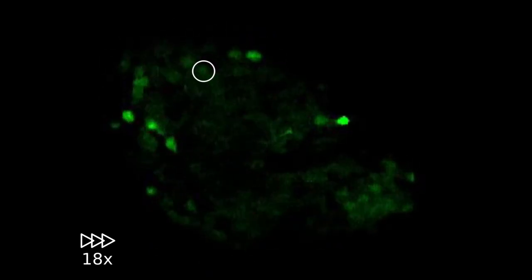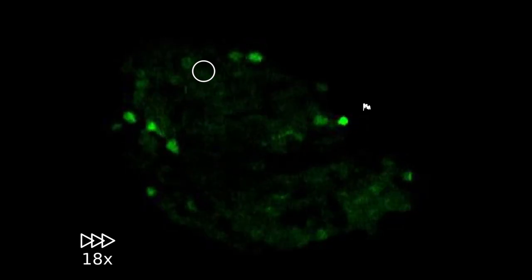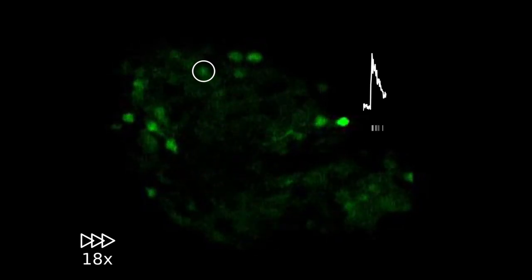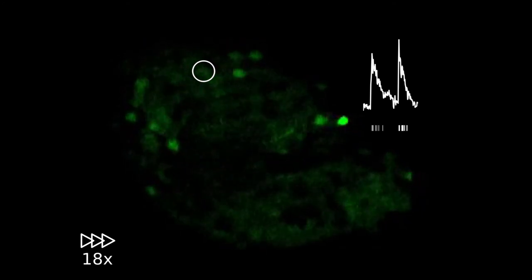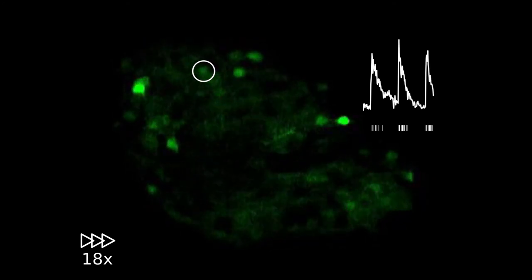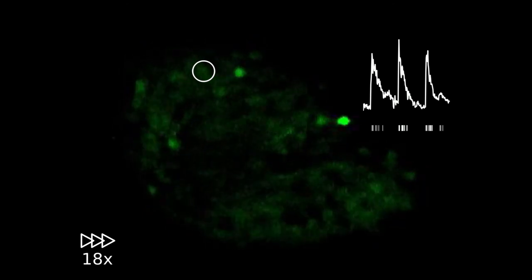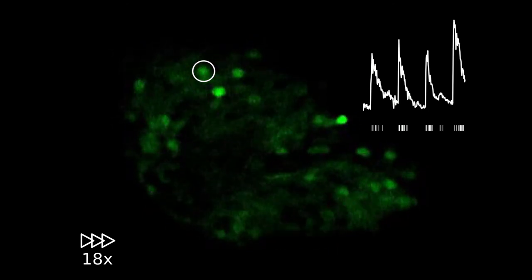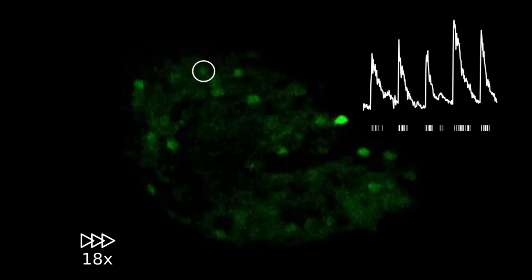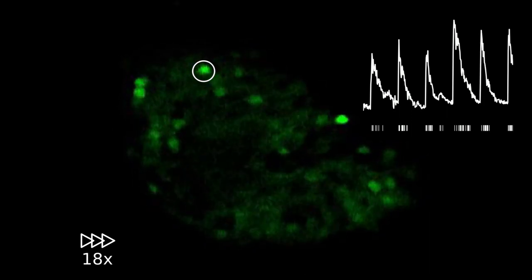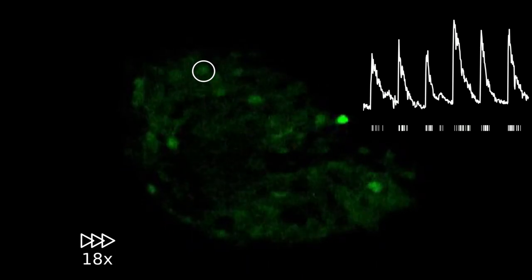Now, let's focus on the circled neuron. On the right side, you can see the plot of the fluorescent changes caused by this neuronal activity. Each of these fluorescent peaks is a result of multiple spikes. One could utilize some algorithms to decode the numbers of spikes that result in this fluorescent change, and you can see the example spikes below the fluorescent plot.